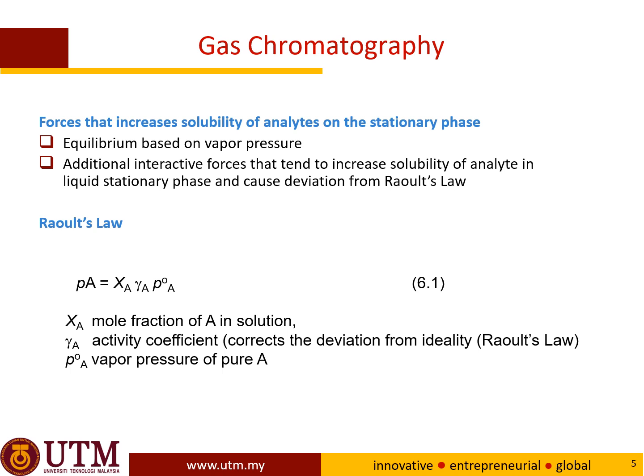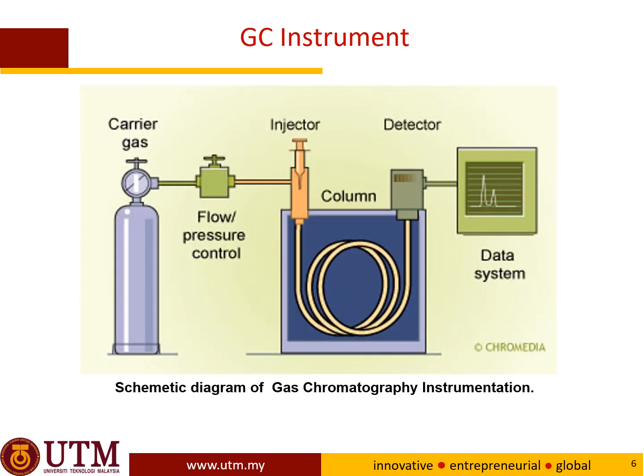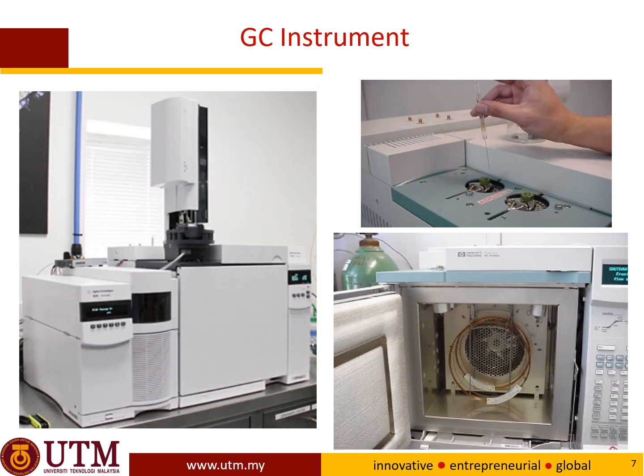In gas chromatography, the force that increases the solubility of the analyte on the stationary phase depends on the vapor pressure. When we are talking about vapor pressure in equilibrium, we are using Raoult's law, once again just like distillation. So this again, same.